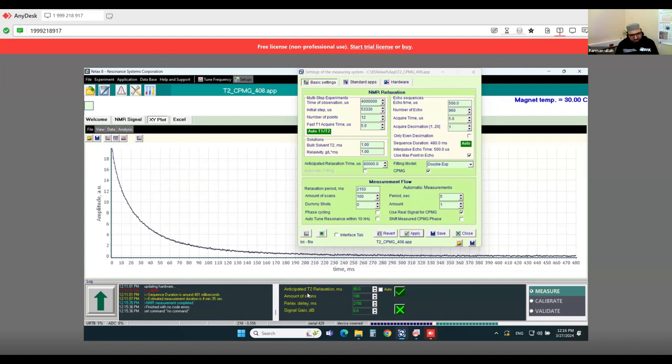So as I am giving some general idea about how to run this equipment and how to analyze the data of the sample, in detail, if you want, you can use different sequences for solids and for others. It depends upon your sample, which in a short time can give you a good result. I'm saving time due to lack of time.